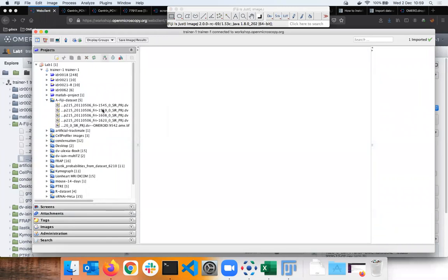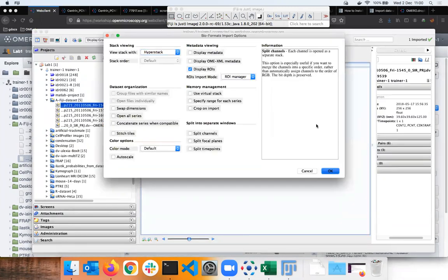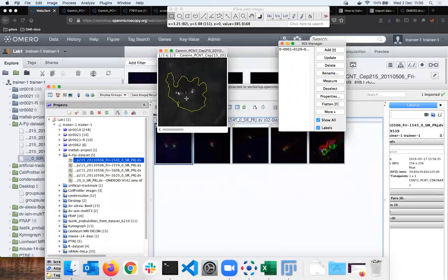again the first image, okay, then it will demonstrate for you in the first place that I can do a 2-way trip with the ROIs. So the image will be now open with the region of interest, which is now coming from OMERO, remember? Okay, I drew this ROI first in Fiji. I exported that ROI into OMERO on the same image. Then I reopened that image again in Fiji, and it has, unsurprisingly, the OMERO region of interest in it.